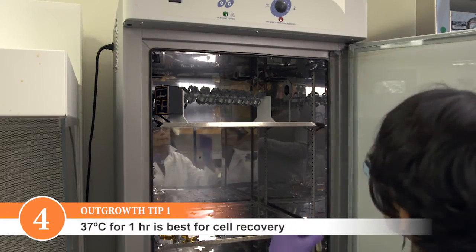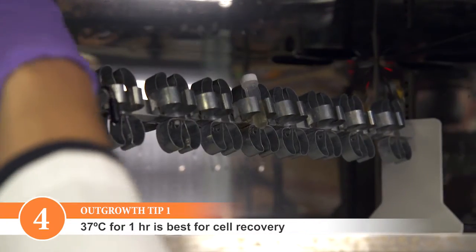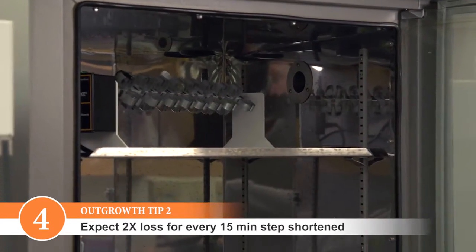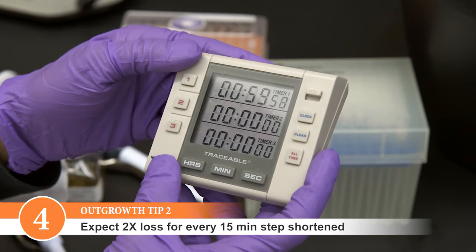Outgrowth at 37 degrees Celsius for one hour is best for cell recovery and for expression of antibiotic resistance. Expect a two-fold loss in transformation efficiency for every 15 minutes you shorten this step.